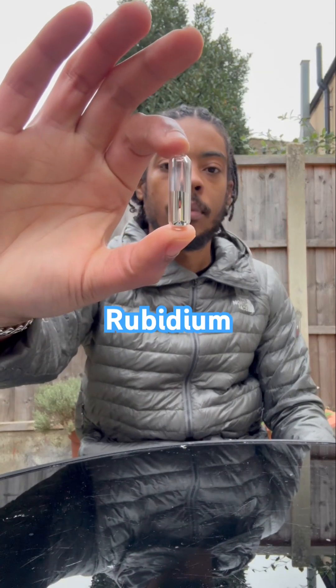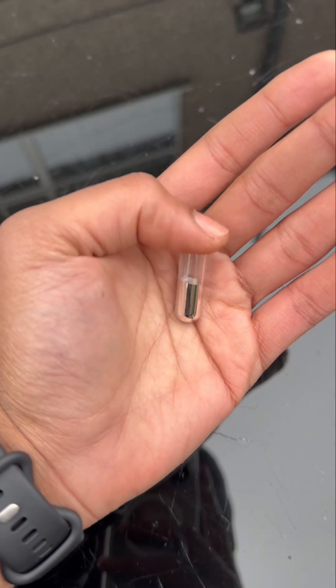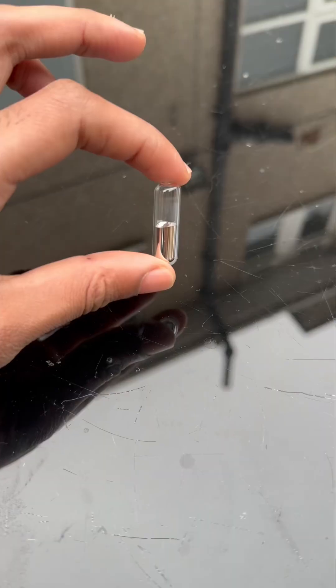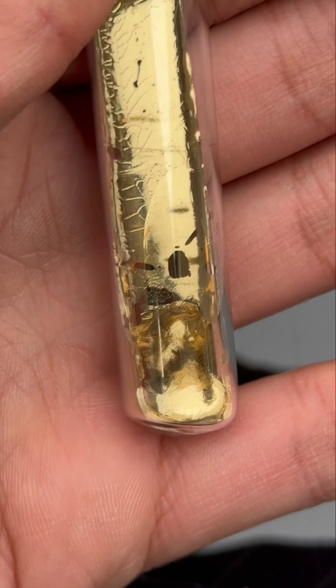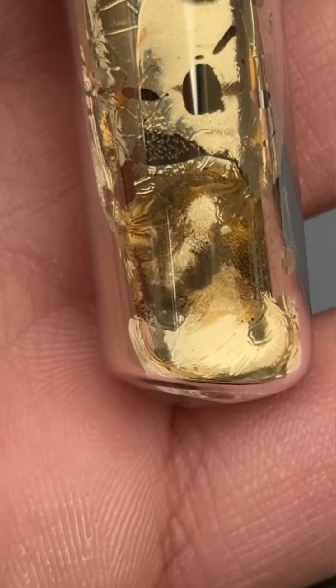Right here, I've got some rubidium metal. Now rubidium is crazy — this is the second most reactive metal in the whole world. The only thing more reactive than this is cesium. And I've got a little piece of cesium there; it's gold in color.